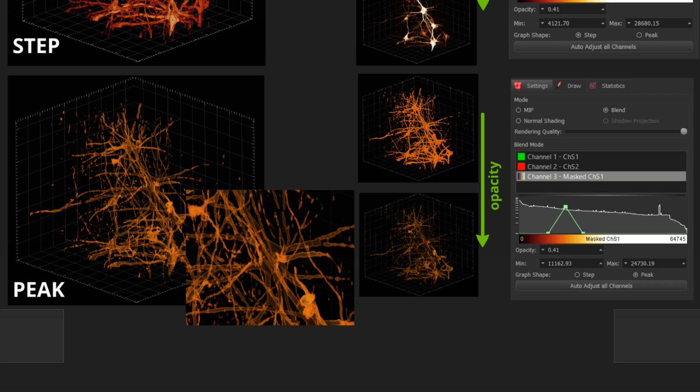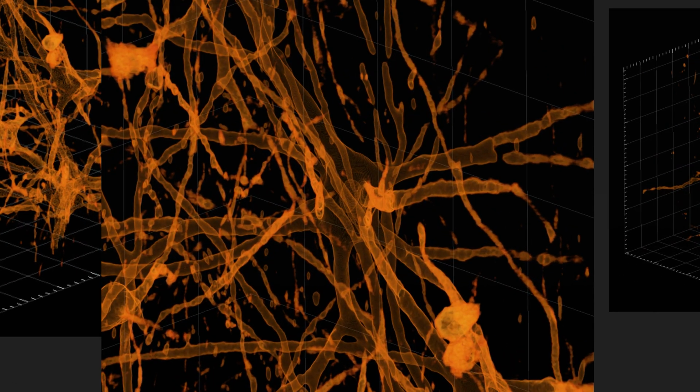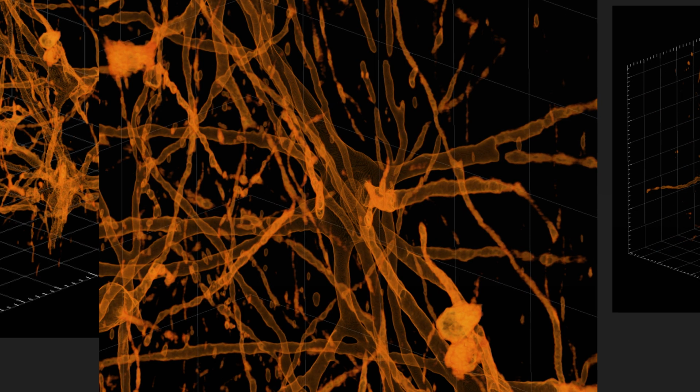Okay? So instead of varying the transparency of everything, we're choosing a particular intensity range, which gives us the ability to retain a lot of the dimmer signal but make the inside of those structures hollow, and therefore it's easier to see structures that are inside of that outer structure. So I think hopefully this helps you to see a little bit more that we can see the boundary, but the inside of these projections that previously were just gone, they're now retained and they're hollow. Okay, so highly recommend this one for anyone that's looking inside of a solid structure. It's an awesome technique.